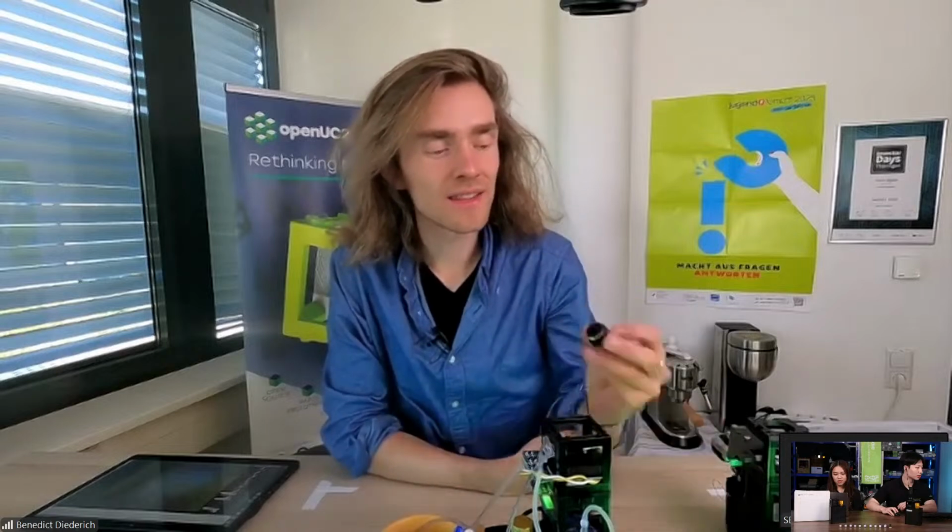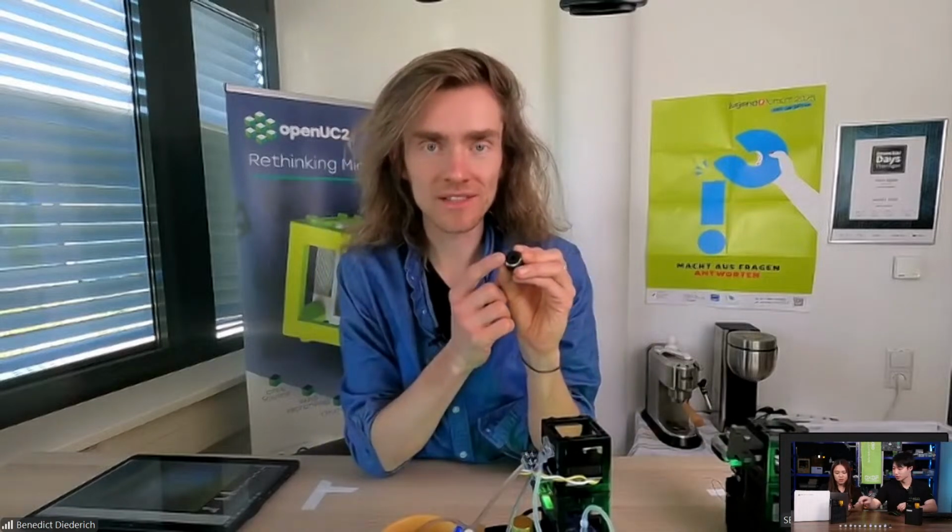And let's pick out another one. This is from Brian. Are these standard microscope lenses? Yes, exactly. So, how is a standard microscope lens defined? They have a certain thread that's called RMS, which stands for Royal Microscopy Society.